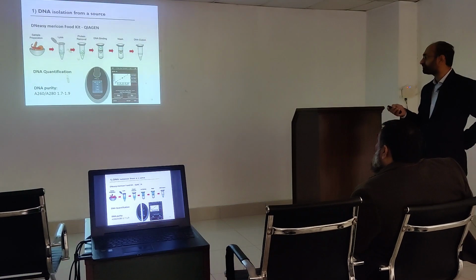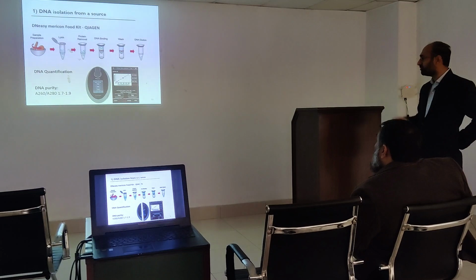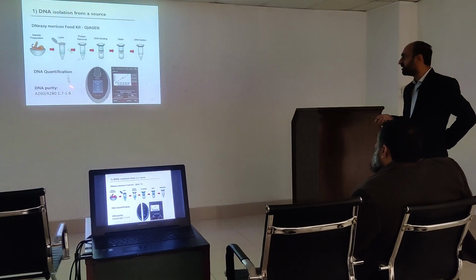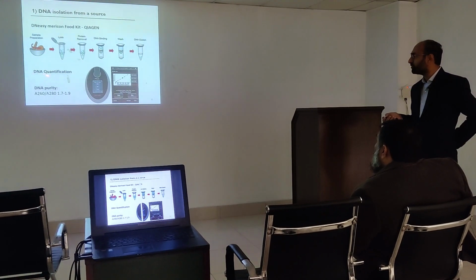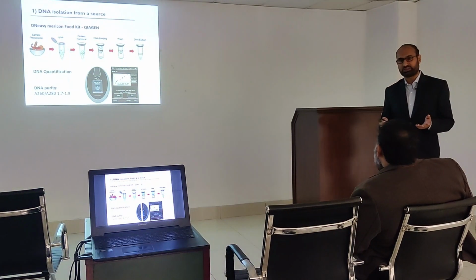Bioinformatics analysis. So this is genomic DNA isolation. I do not need to go into the details. Just one thing, for NGS we have to quantify the DNA using Qubit fluorometry. We do not rely on spectrophotometer techniques like NanoDrop. We have to use a fluorometer for the quantification of the exact amount of DNA.